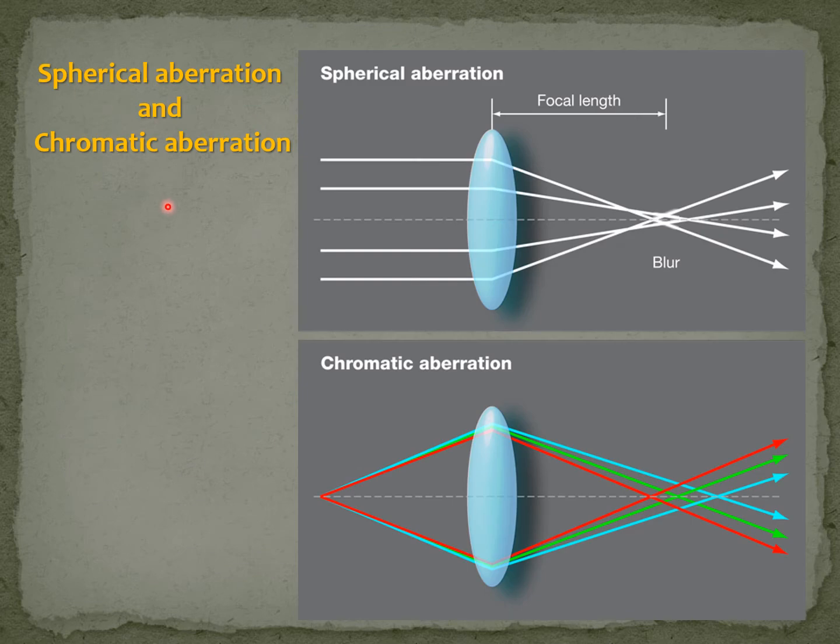Different from the spherical aberration I just described is what we call chromatic aberration. The rays there can all be blue rays, so we will have a dispersion of rays instead of focusing on one spot. But imagine that the incident light was composed of three different wavelengths: the blue, the green, and the red.